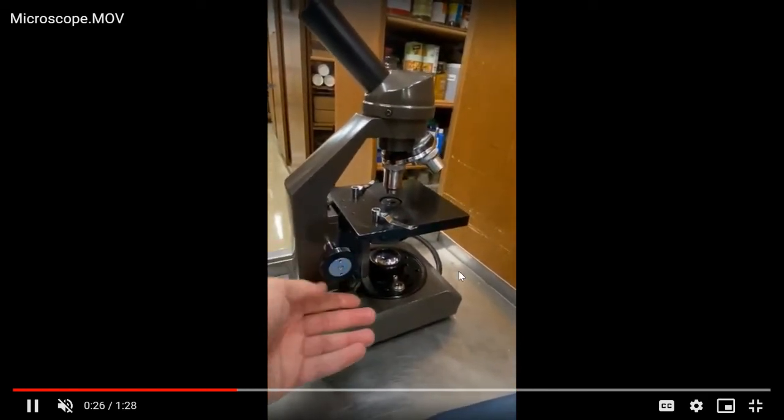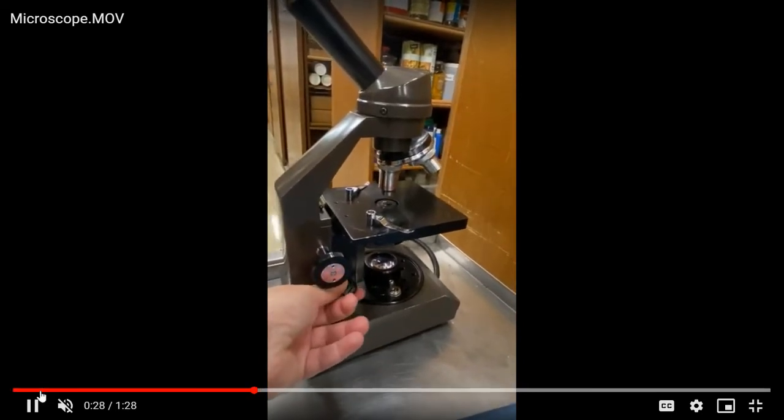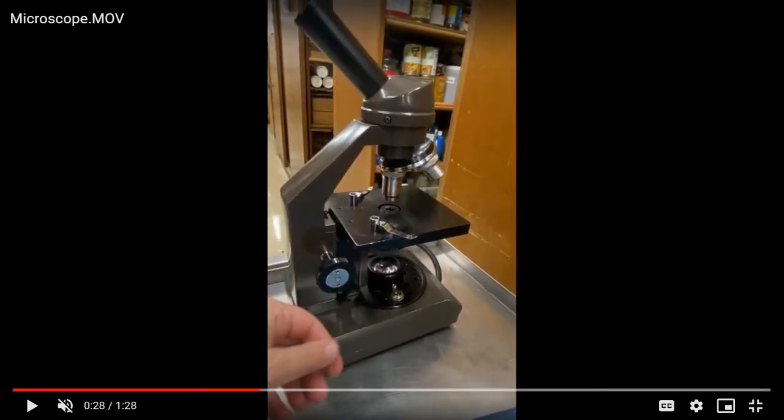Then the smaller knob down here is called the fine adjustment. When you move the fine adjustment, it moves the stage just a little tiny bit at a time.